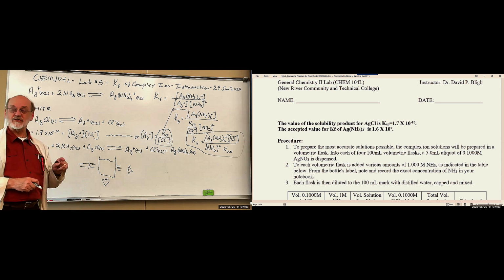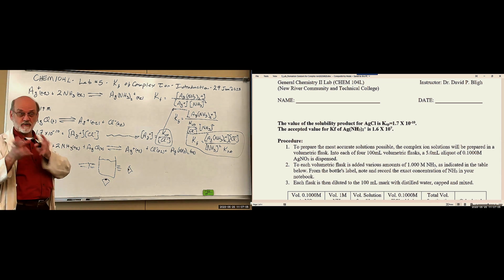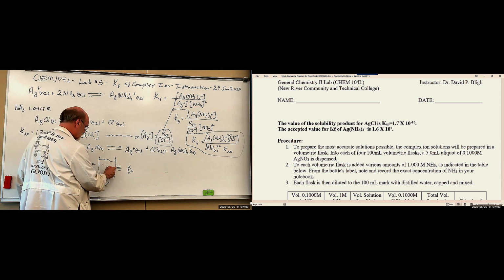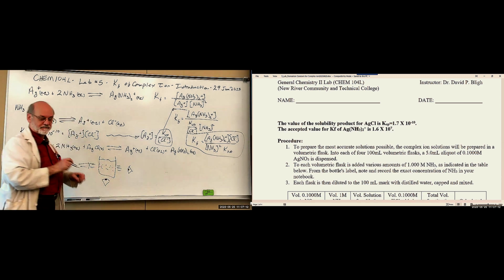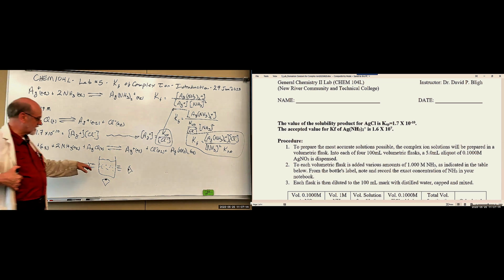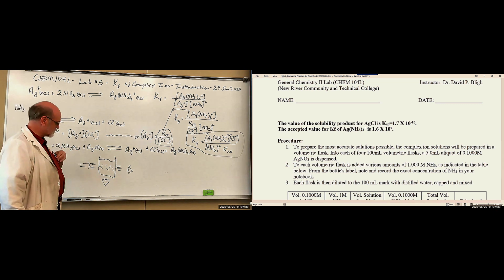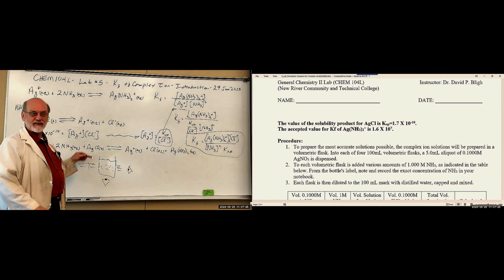But if you have a suspension, which is our case, where the precipitate forms a suspension, then you can see the light beam in there. You can detect that a lot easier with dim room lights. You can see that light beam shining through there, and all you have to do is move it up and down, and you can see the light beam move.